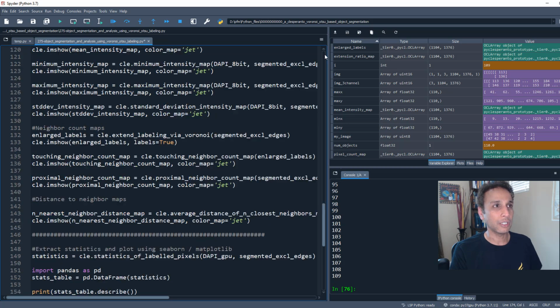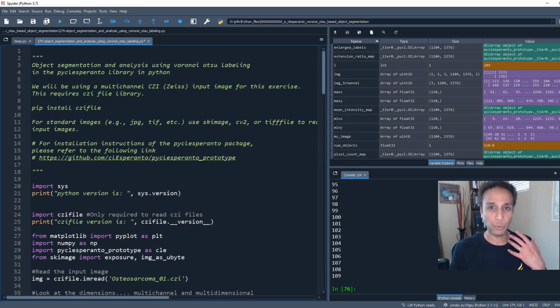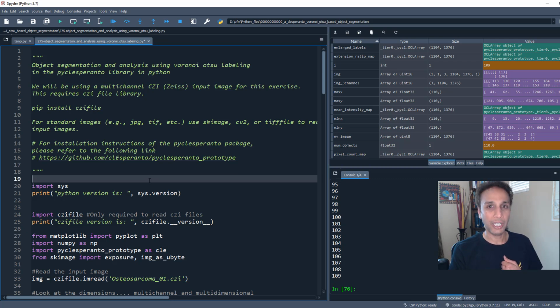And again, before jumping into deep learning, if you want to get a task done, see if there are any classical ways of getting it done. And there's probably an amazing library out there like pyclesperanto for your specific task. So first investigate that and then jump into deep learning. I'm a huge advocate of deep learning, but I think if an application doesn't require that, then Occam's razor, guys. Whatever the easiest solution is, that's exactly what you should be following.